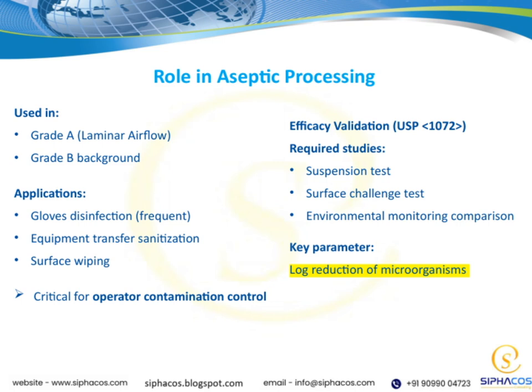Their applications are quite broad but essential. They are used frequently for gloves disinfection, to prevent contamination from operators. They are also vital for equipment transfer sanitization and surface wiping, ensuring all contact points remain sterile. Ultimately, these disinfectants are critical for contamination control, especially when it comes to protecting operators and maintaining the integrity of the aseptic environment. Their proper validation and use are fundamental to ensuring patient safety and product quality.